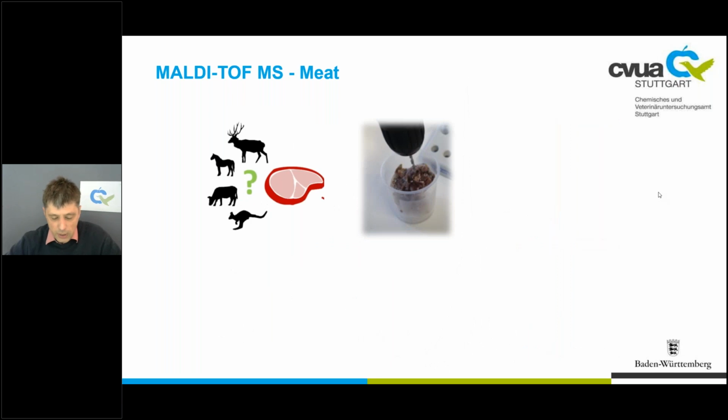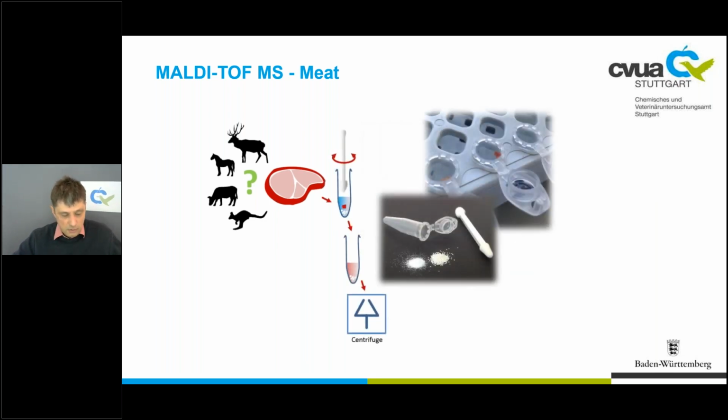The sample preparation is easy to handle too. Starting with frozen meat, we drill a pin-sized subsample. Then the tissue is mechanically abraded in the usual organic solvent mixture using a pestle and zirconia beads together.